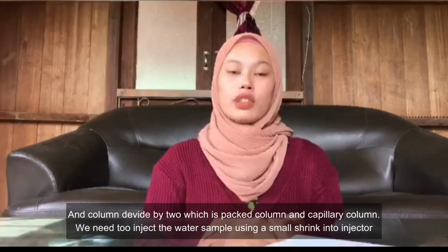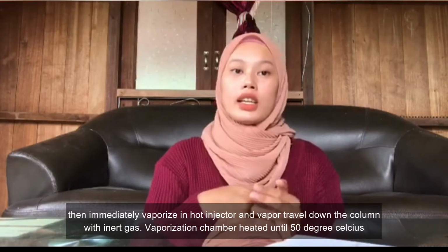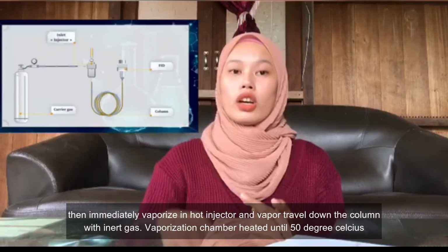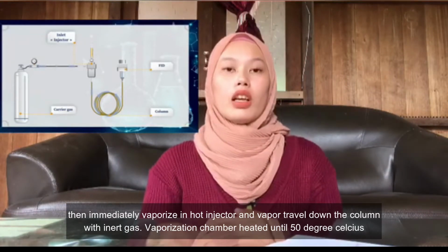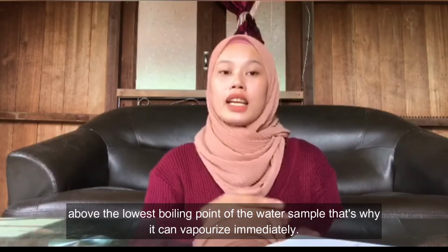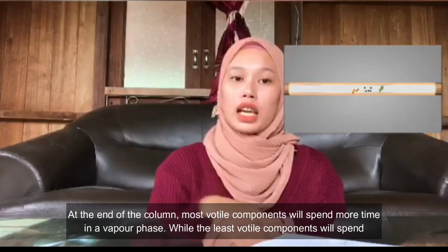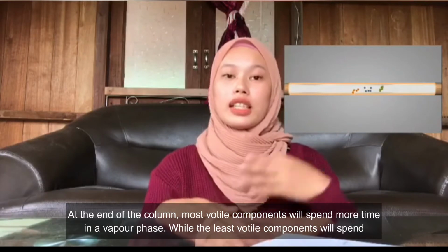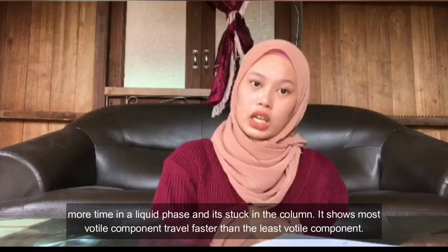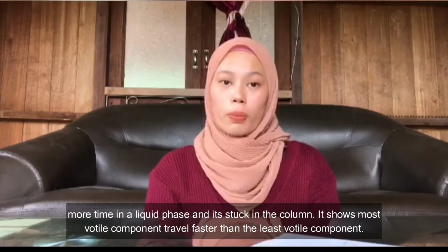First of all, we need to inject the water sample using a small syringe into the injector, and it will vaporize immediately in the hot injector, and the vapor will travel down to the column with an inert gas. The vaporizing chamber heats to 50 degrees Celsius above the boiling point of the water sample, and that's why it vaporizes immediately. At the column, the most volatile component will spend more time in the vapor phase, while the least volatile component will spend more time in the liquid phase and gets stuck in the column. It shows the most volatile component travels faster than the least volatile component.